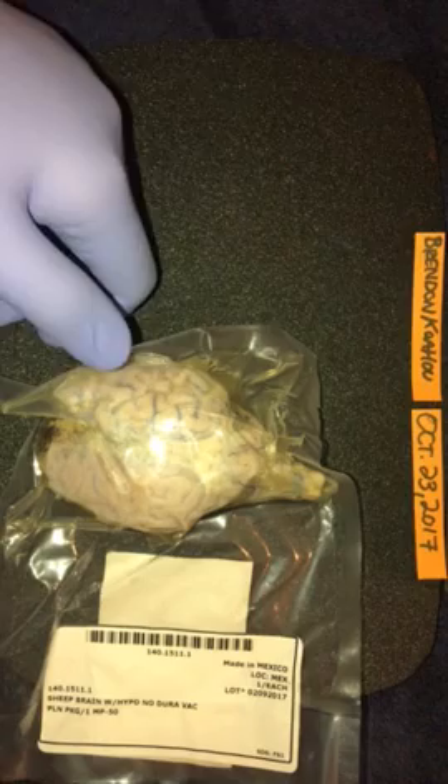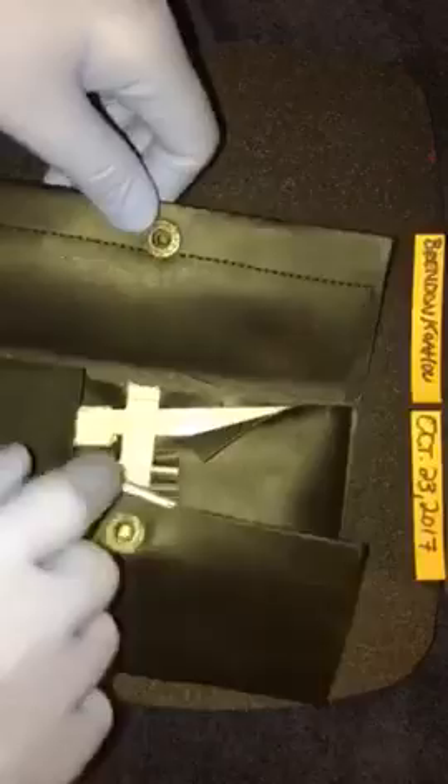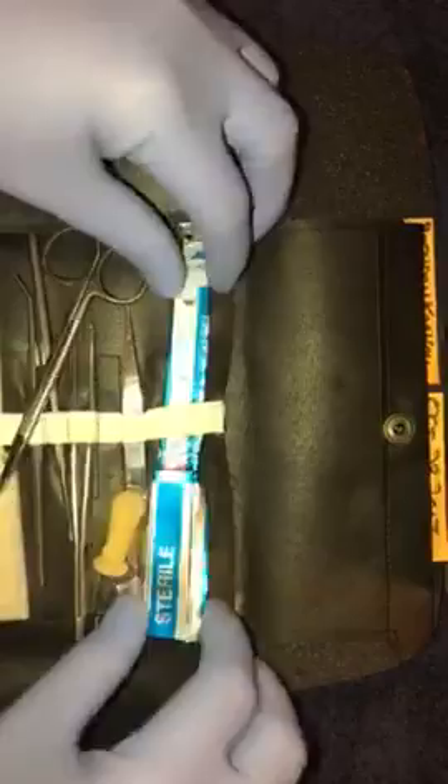Hello again, Brendan Kowahu here. Today is October 23rd, 2017 and we're gonna cut some stuff open again. Let's just start out by pulling open my kit here, displaying all my tools.